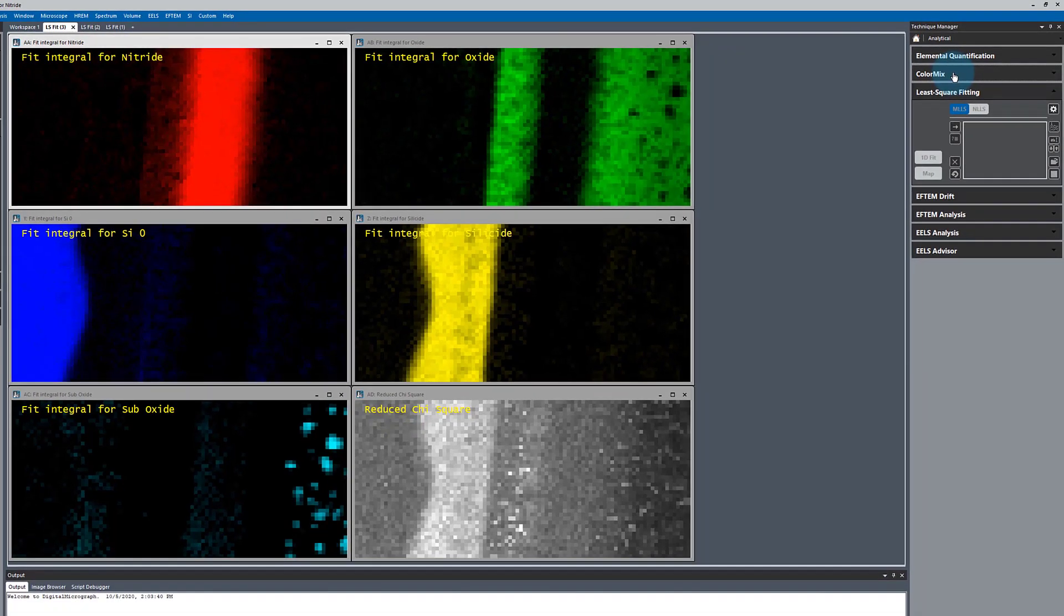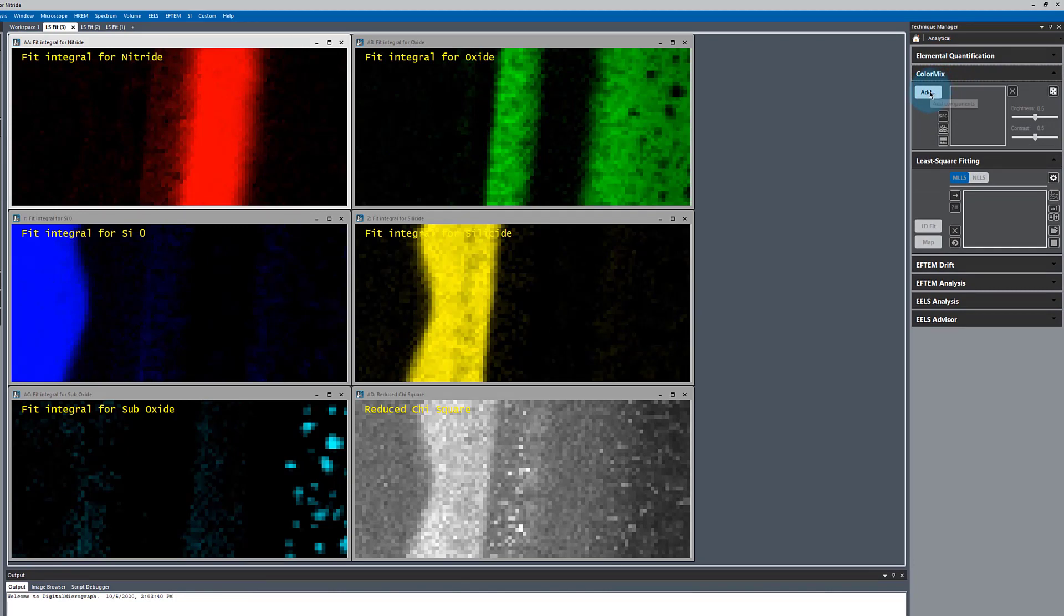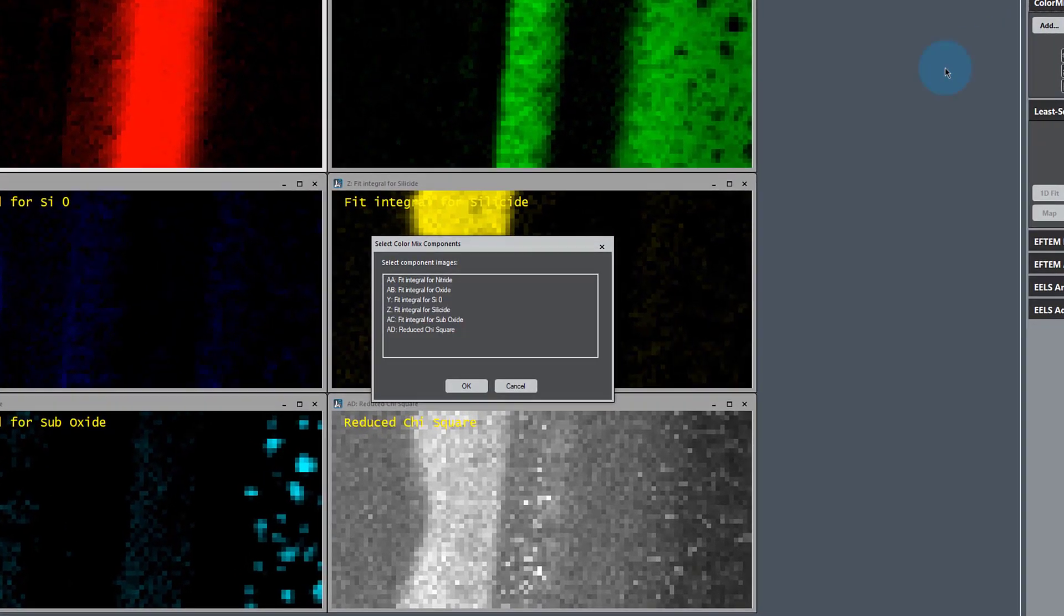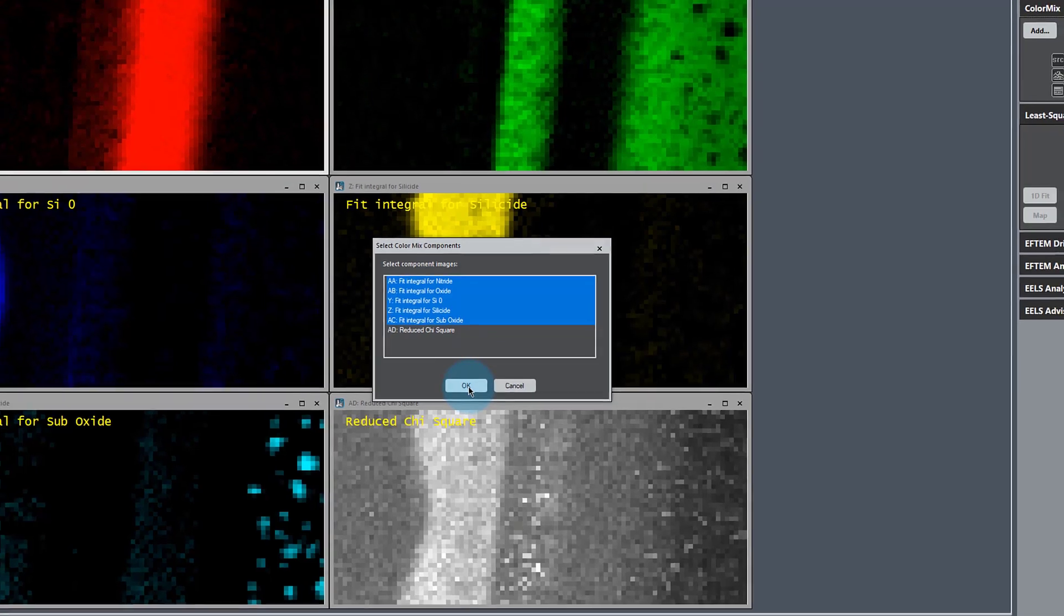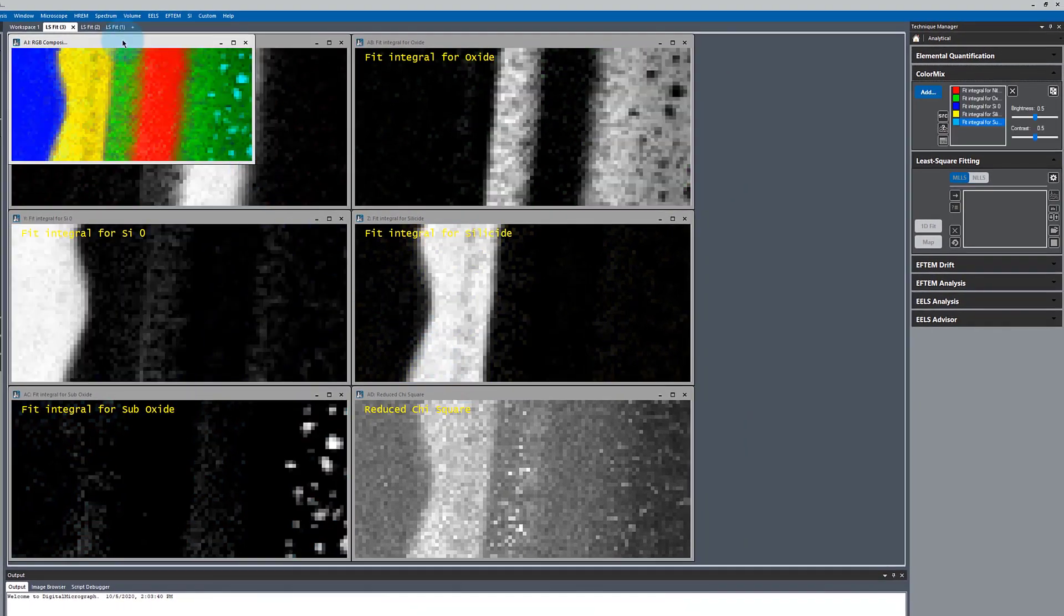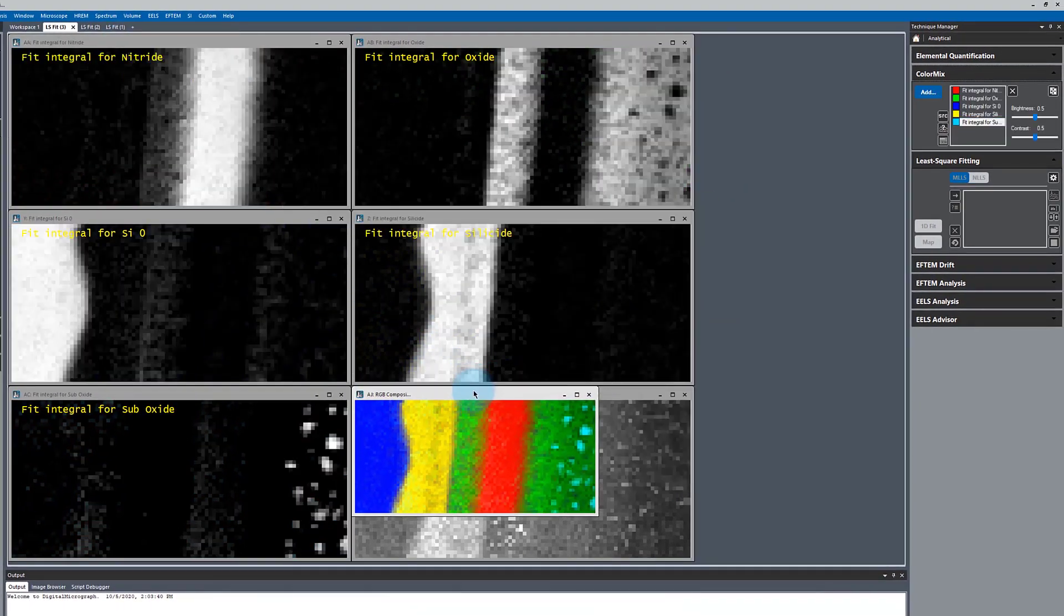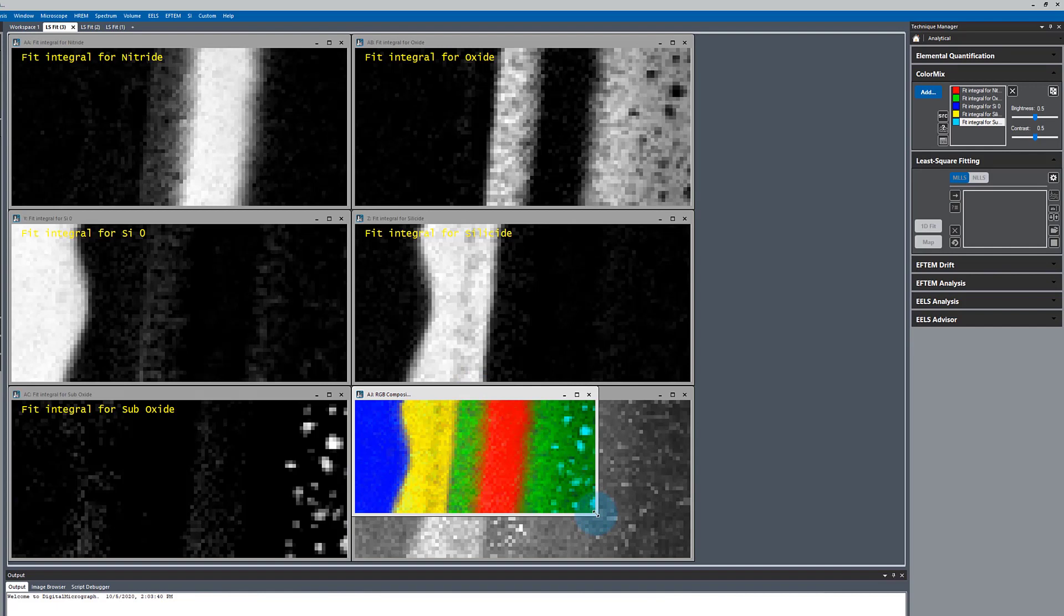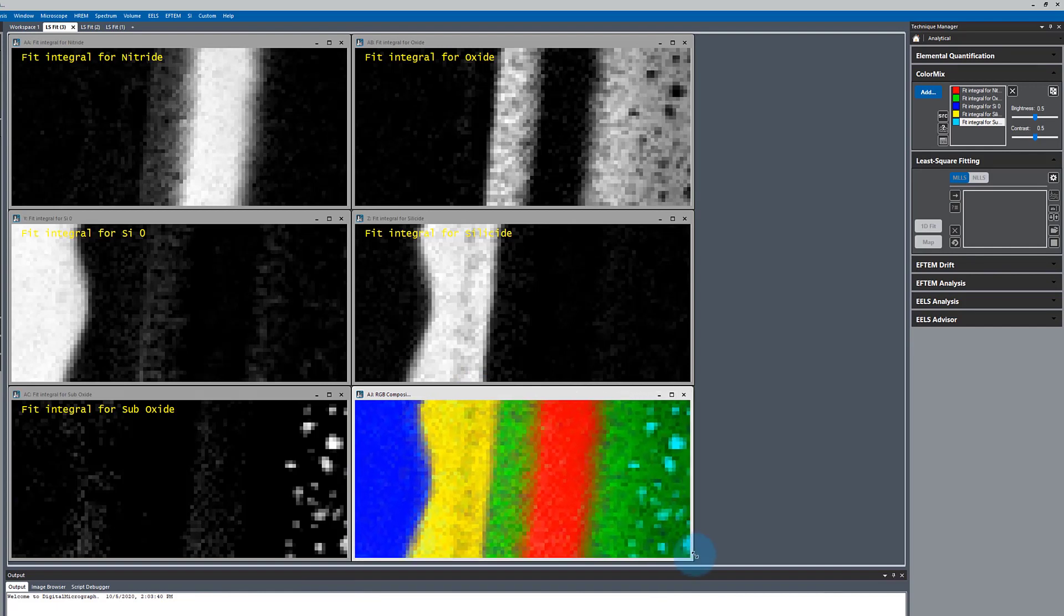To help visualize the data, we can use the color mix tool. We'll open our color mix palette and add our chemical maps: nitride oxide, polysilicon, silicide, suboxide. The chi-squared map we won't add in. You see that these show up in the same colors that they originally were listed. So we get a nice rendering of this.